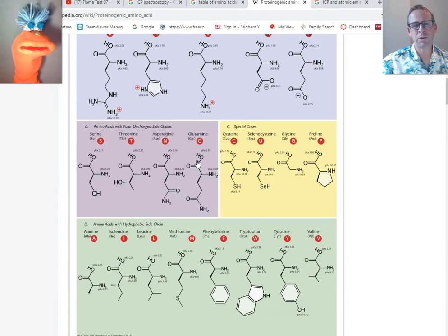Or what kind of chemicals can absorb an increased amount of electromagnetic energy? You mean like aromatic and stuff? That's right. Aromatic chemicals like these regions down here, phenylalanine, tyrosine, and tryptophan, right?